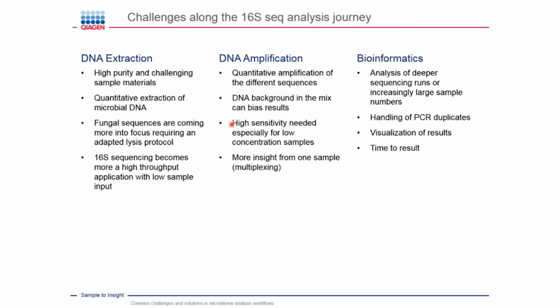So now you have done all your wet lab work, you have given your libraries to the sequencing facility, and then they come back to you with something like 20 or 60 or sometimes even more gigabyte of data, which for me as a biologist or biochemist is something at the beginning I had no idea what to do with. It's really a different world. I don't have a bioinformatics background, but you need this, or you need to have a good solution.